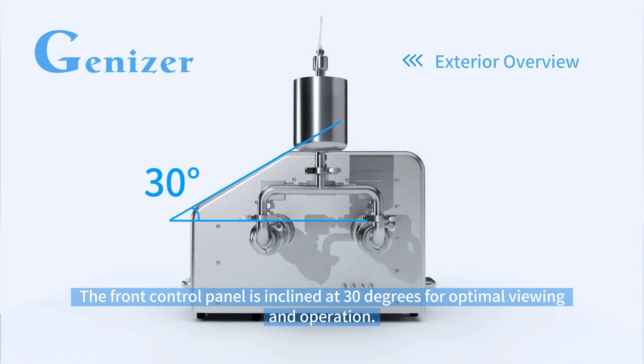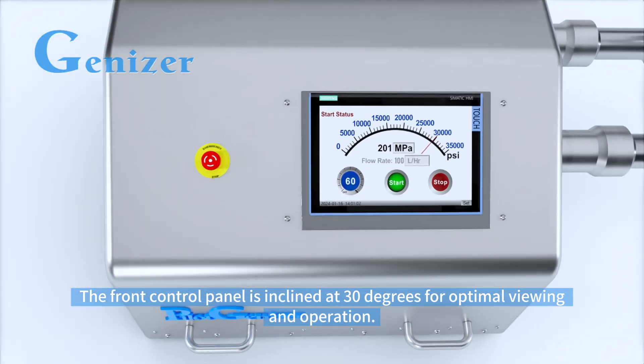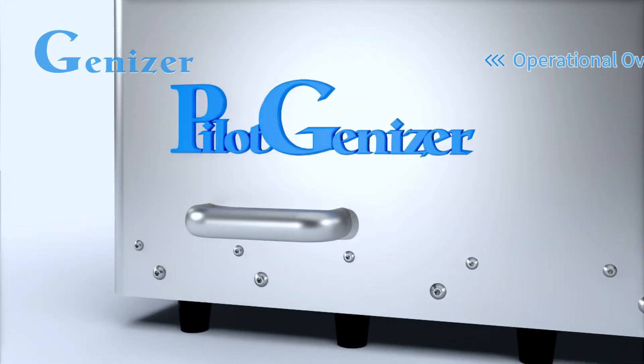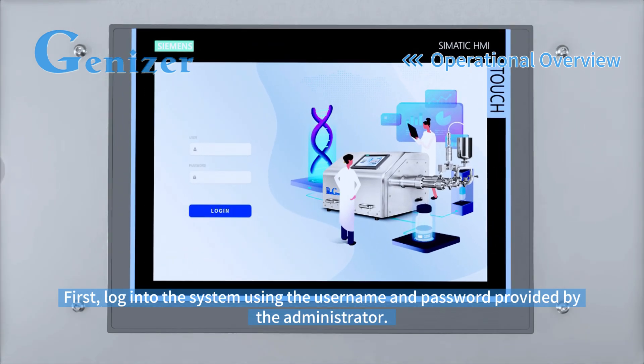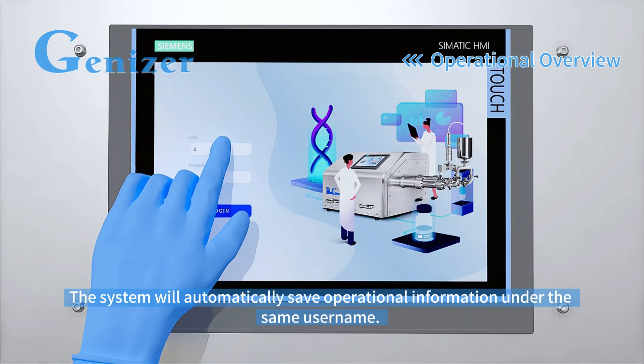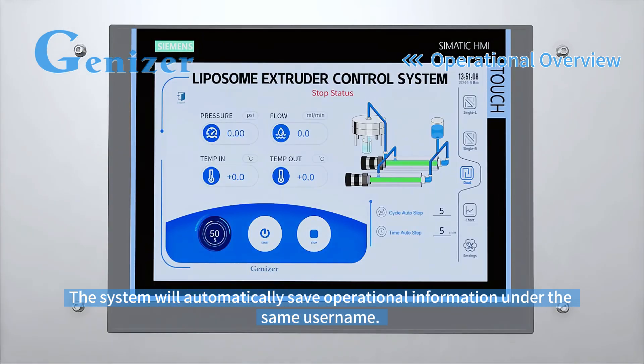The front control panel is inclined at 30 degrees for optimal viewing and operation. First, log into the system using the username and password provided by the administrator. The system will automatically save operational information under the same username.